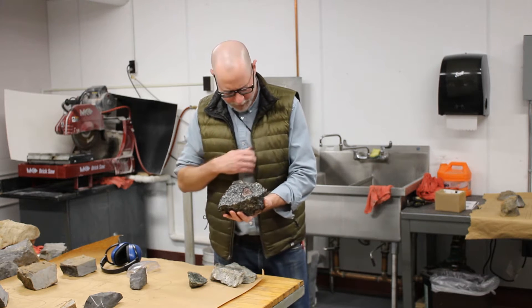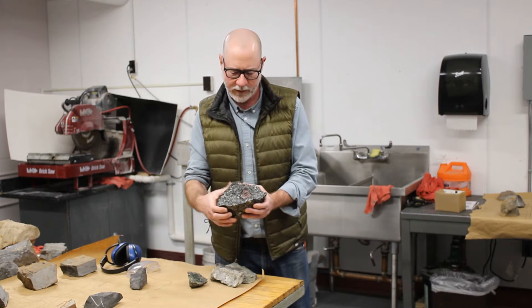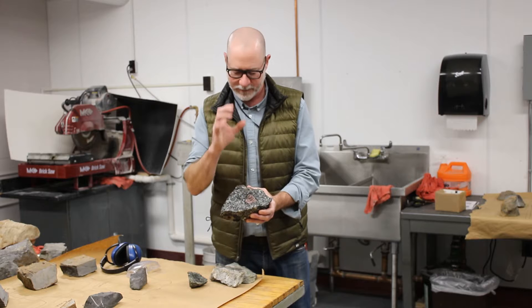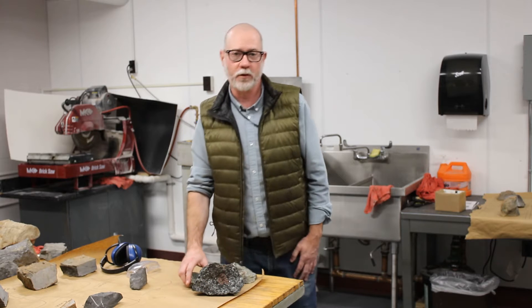So we collected this rock and do our initial investigations on it. But we want to really look closely — we want to see the microscopic relationships between the minerals. We then cut this rock and make a thin section out of it. So we're going to do that today.